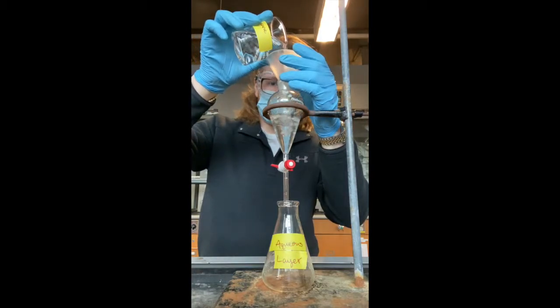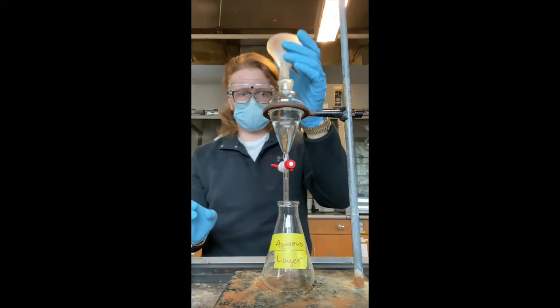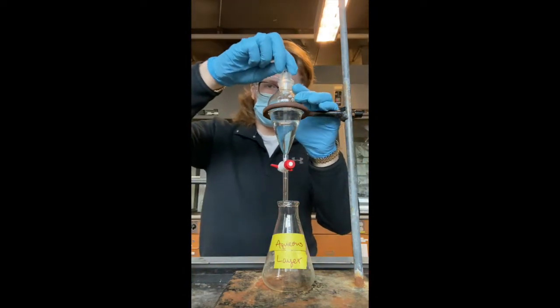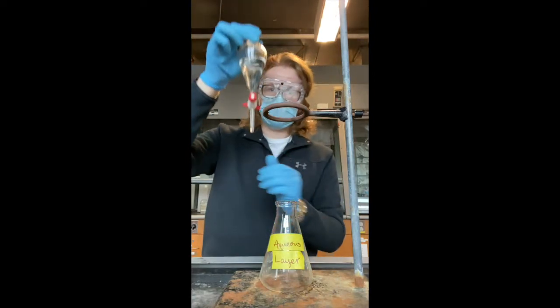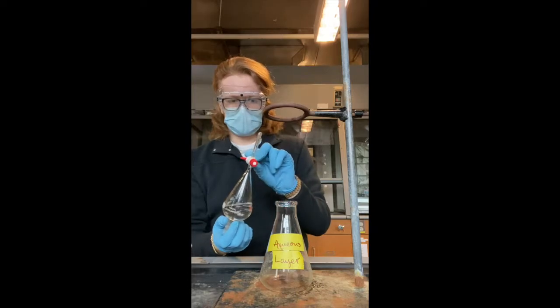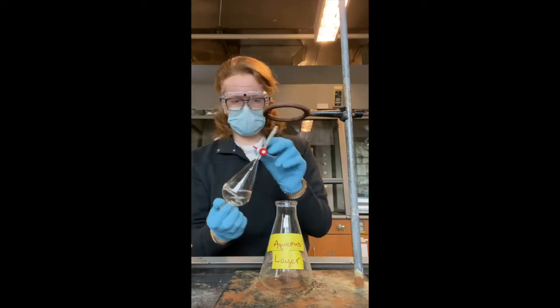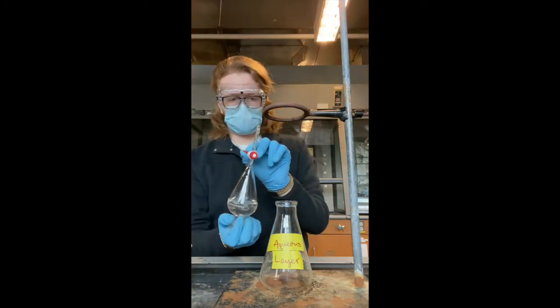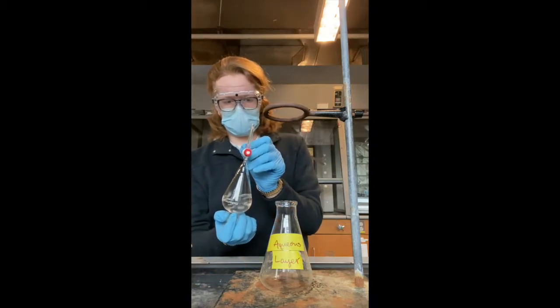Then, you will pour in some of the solvent hexane to extract what is left of the compound in the aqueous layer. Once finished, you will put the glass stopper back into the separatory funnel and repeat the procedure you completed to mix the organic and aqueous layer. Once again, open the stopcock to release the pressure and close it before shaking the separatory funnel. Then open the stopcock again to release the pressure and close it before continuing with the shaking, completing this process a total of 3 times as you have just seen.